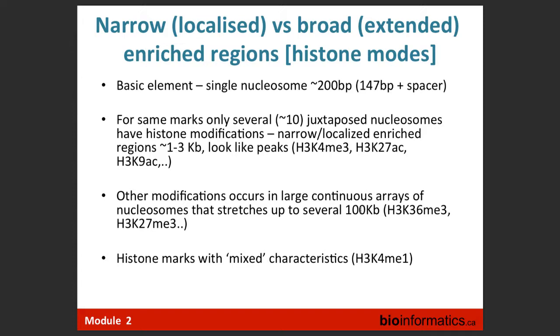However, there are some locations which are fragile. When we have a fragile location, we have breaks occurring in this location more frequently. And then even in our input, we will get a peak, which will be just a spurious peak. This is a bias. Unfortunately, sometimes we have biases, for example, in nucleosome-free regions.